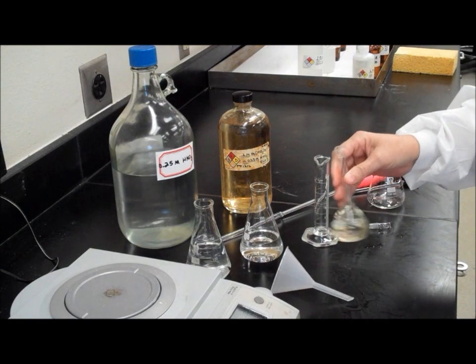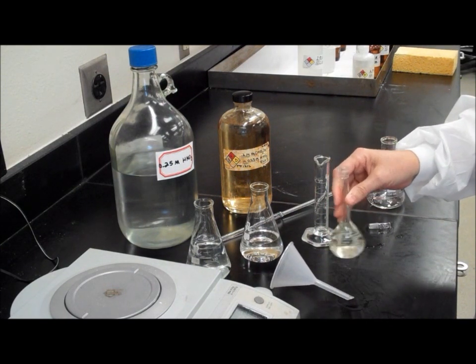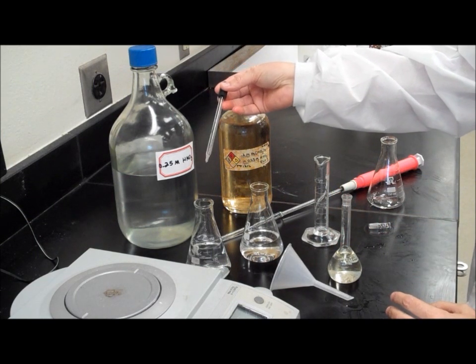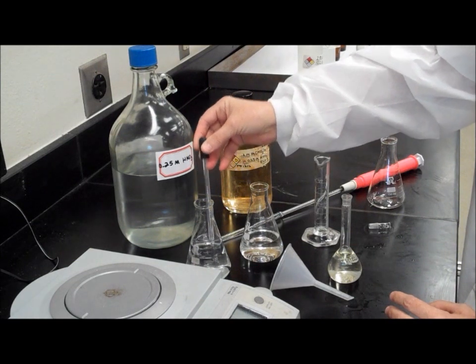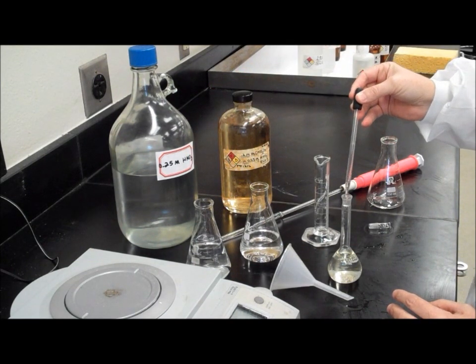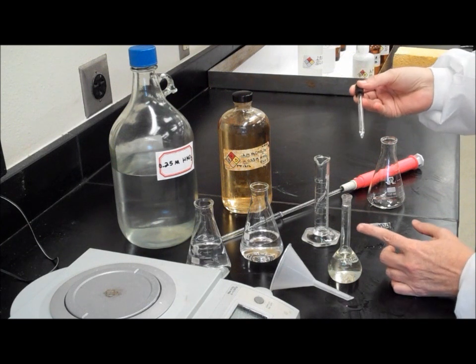Swirl the flask gently to mix. Next, using a medicine dropper, add more nitric acid to your volumetric flask until the meniscus reaches the line on the neck.